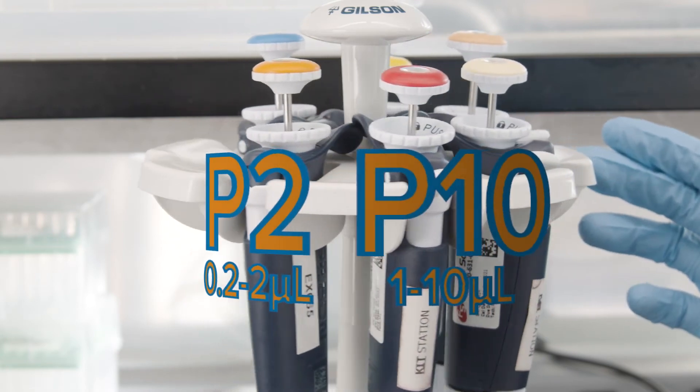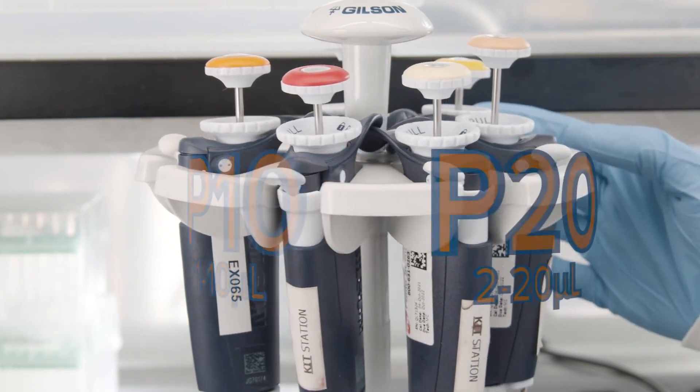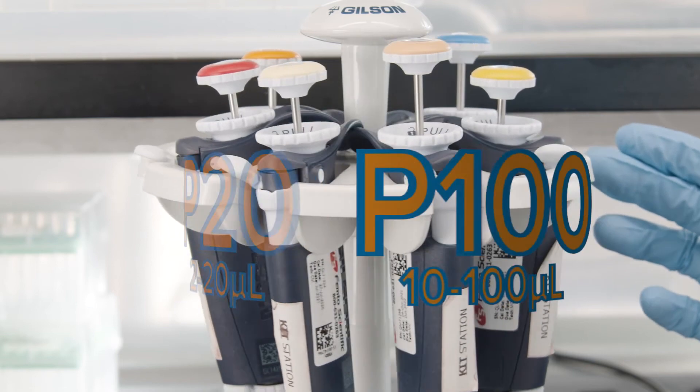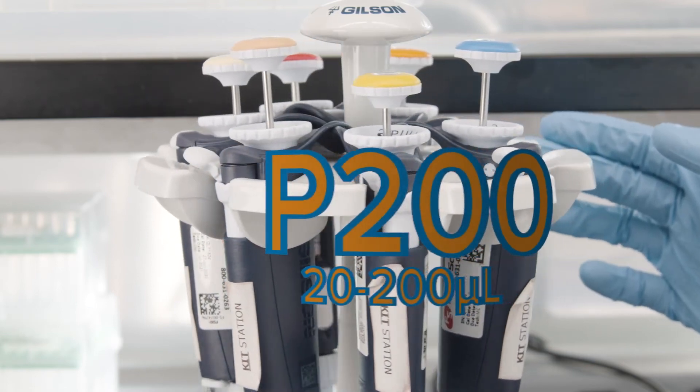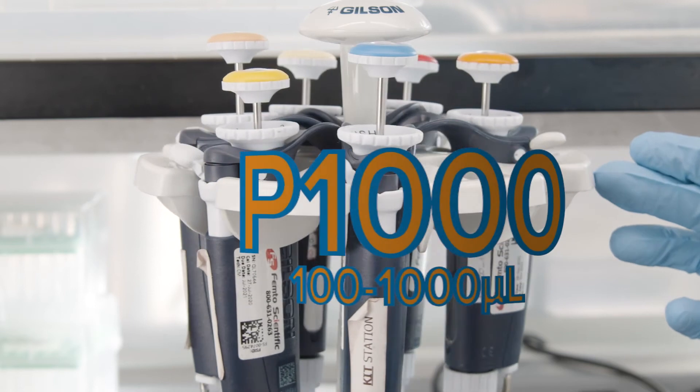There are five standard sizes to choose from. P2, P10, P20, P100, P200, and P1000.